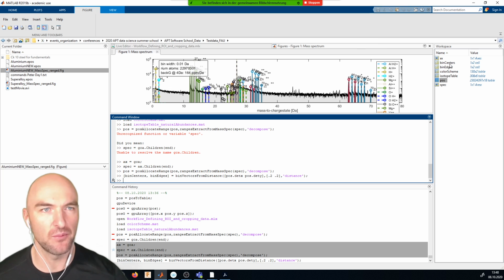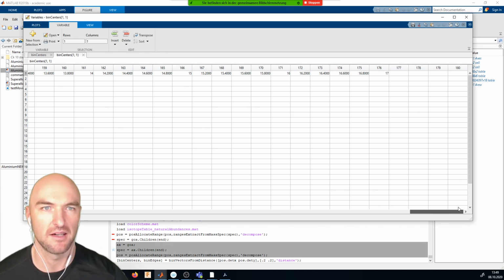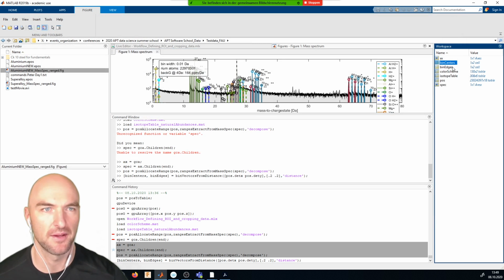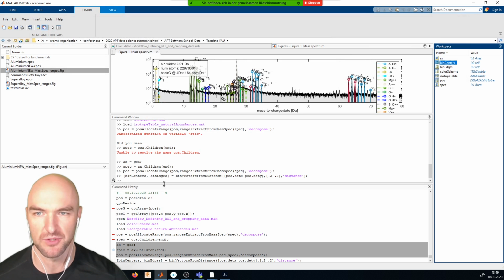Now I can see we have our bin centers variable here, and it goes from -18 up to +17, so roughly the 40 millimeter detector that our atom probe has. You can obviously have two of them, one in X and one in Y direction.